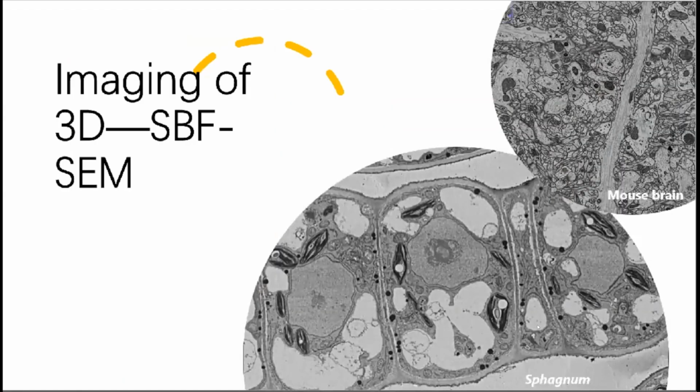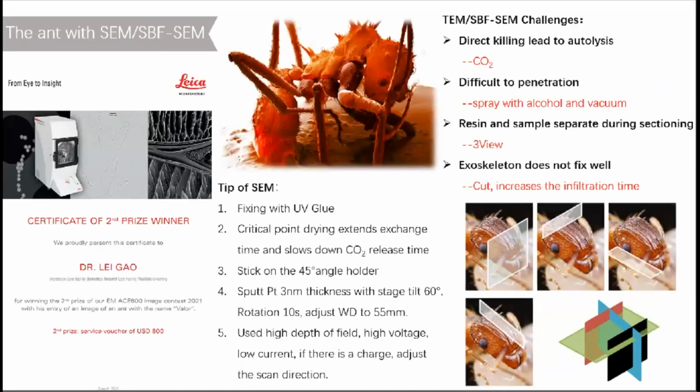Now, let's look at a few cases of SBF SEM. First, I will talk about the African ant.